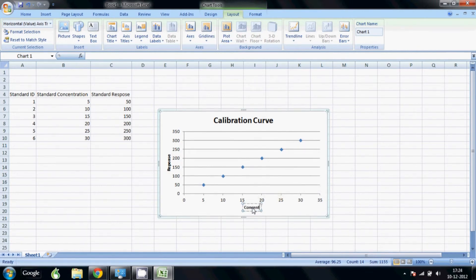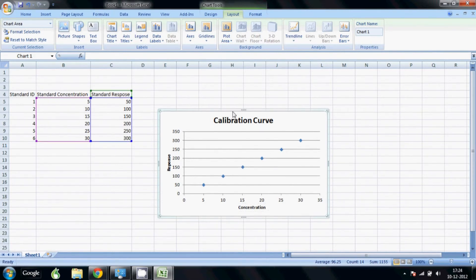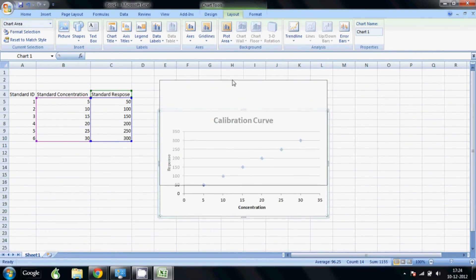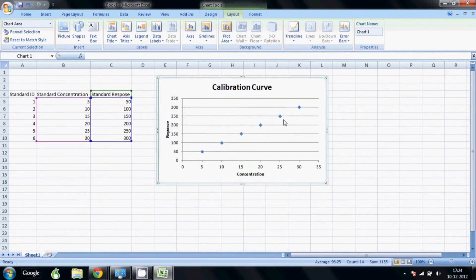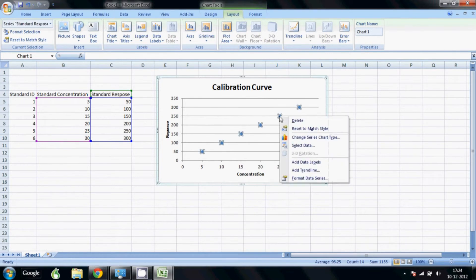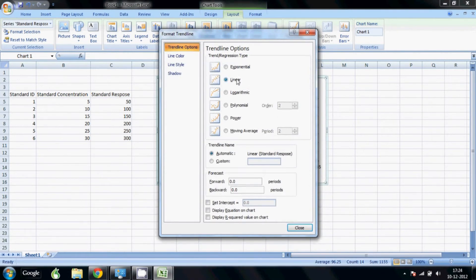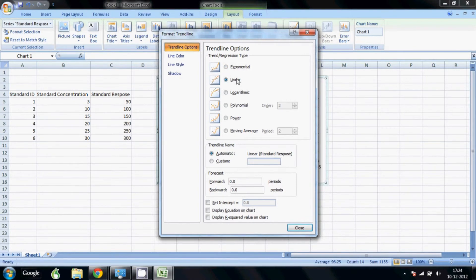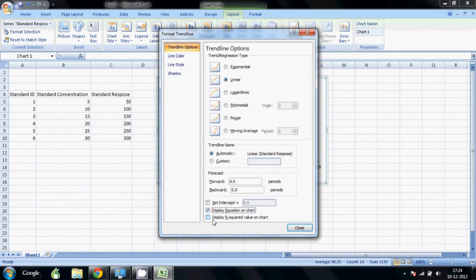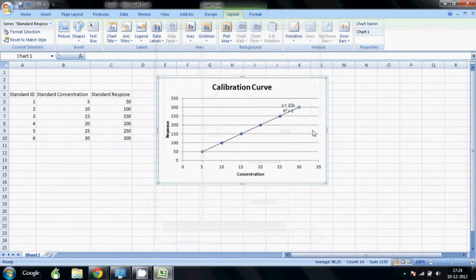Now to add a trend line we right click on the data series, go to add trend line. And mostly we will use a linear, but depending on the kind of data you can use different kind of regression models. So we want to show the equation and also the r square value on the chart. So we just select that and there you go, we have the regression equation as well as the r square value.